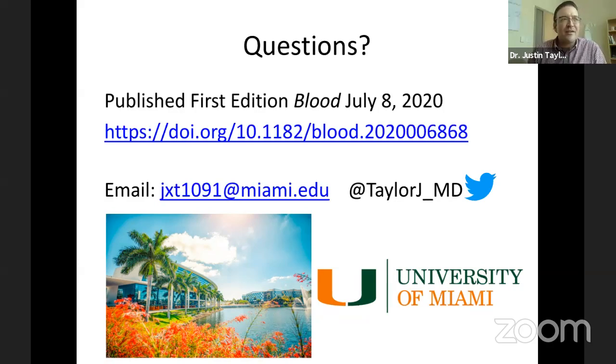Some reviewers wanted to actually confirm single cell sequencing data. So we've done that just to prove also that, not in this particular example, but in others, that single cell sequencing is as good or better than that technique. Yeah, it's interesting to see Sanger sequencing data, and there's still a place for that when you need a cheap option to screen many, many different clones. Yes, yes.